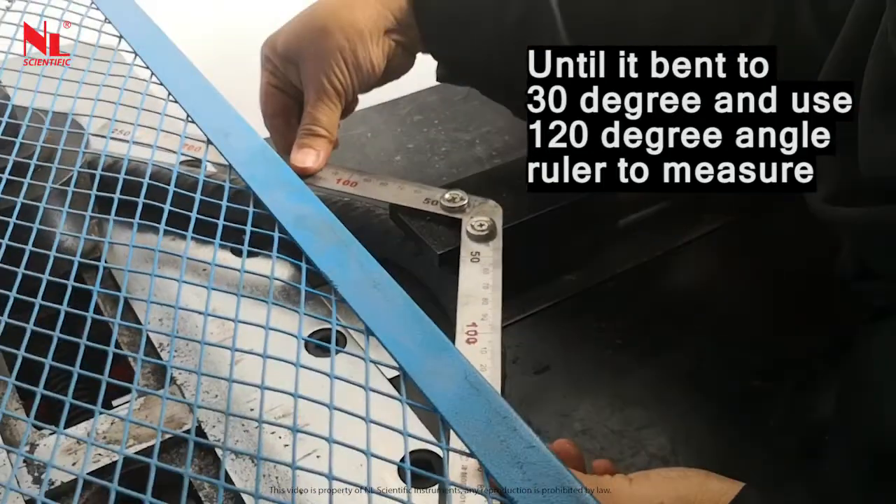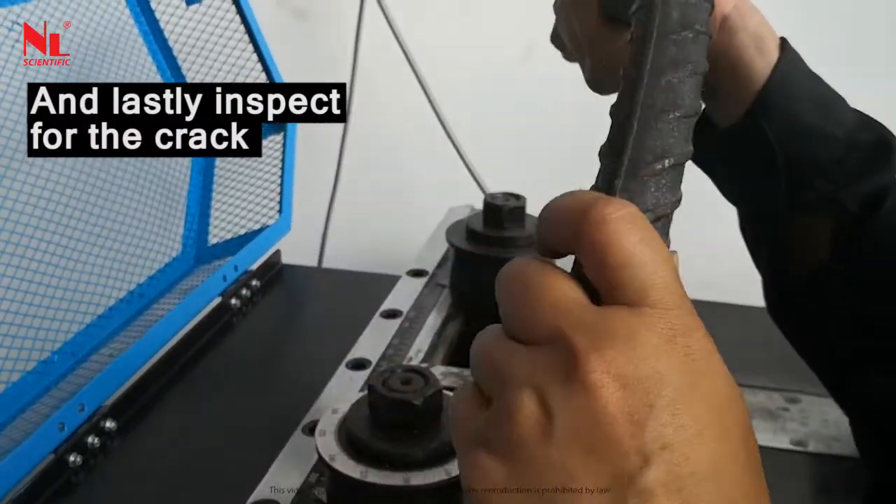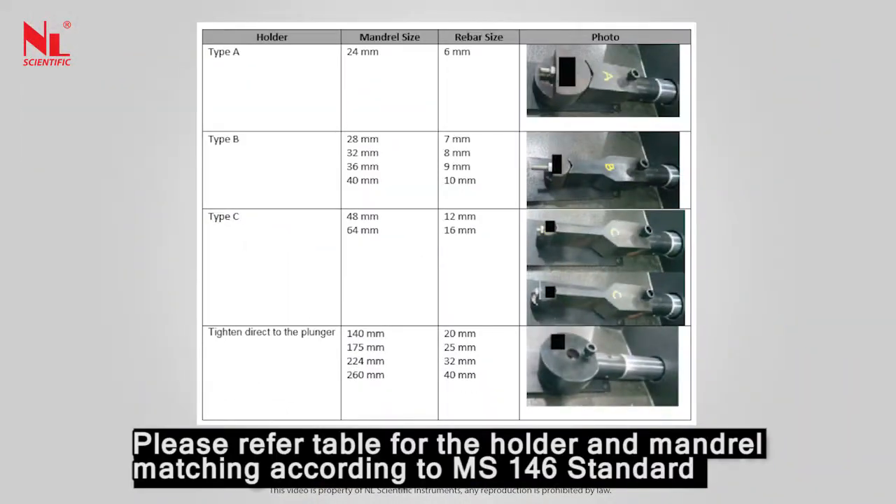Bend until it reaches 30 degrees and use a 120-degree angle ruler to measure. Lastly, inspect for any cracks. Please refer to the table for the holder and mandrill matching according to MS 146 standard.